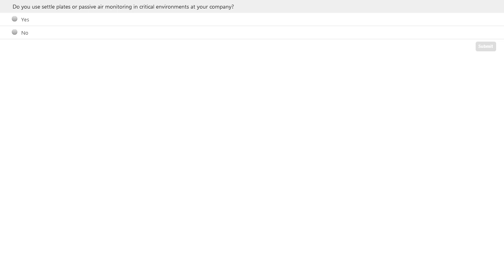Thank you for participating in our poll. I'd like to ask our audience another polling question. Again, please click directly on the screen to enter your answer. Here is the question. What is the main reason to use settle plates in critical areas? GMP requirements, important monitoring data. We do not use settle plates.